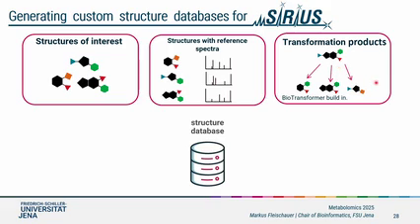And the good thing is, usually these transformation tools also produce transformation products that might not be true, that might not exist. But the cool thing is, since we can compare our spectrum against the structures, it doesn't matter whether there are some structures that do not match anything. It doesn't hurt. So that's pretty powerful.